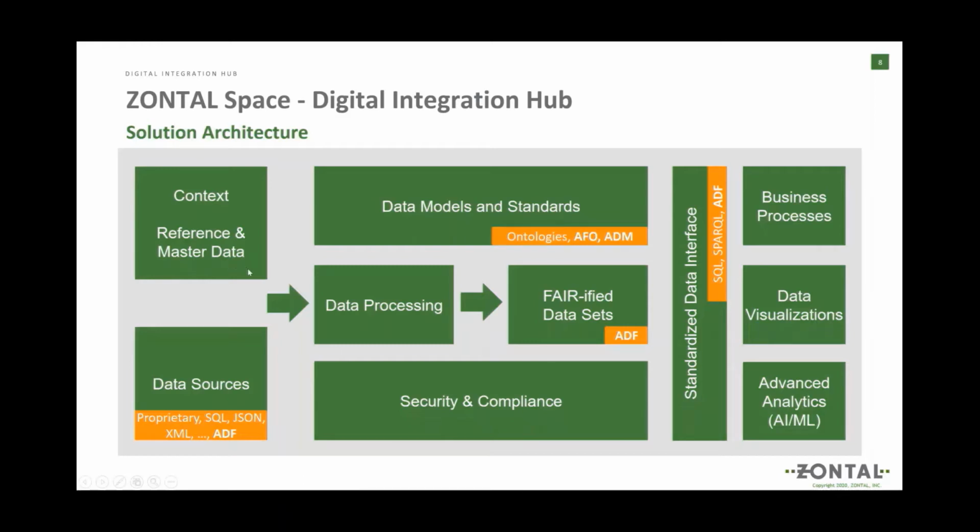Then we need to consider also the context. In order to achieve the findable aspect of FAIR, we need to understand the contextual metadata information. So here we're connecting to reference and master data systems, such as SAP, for example, to get more product background information.